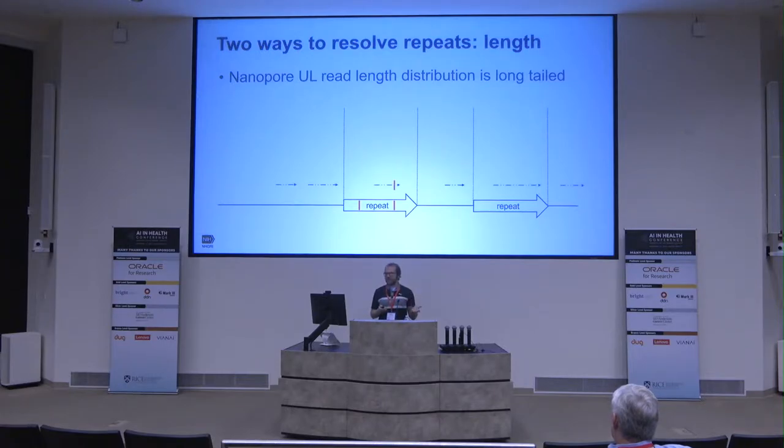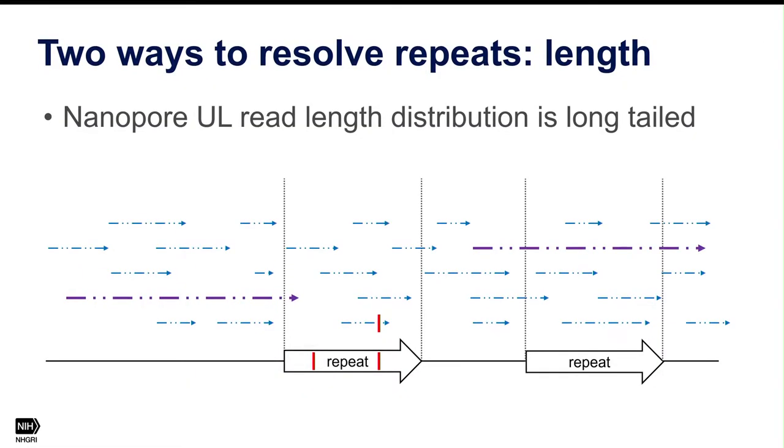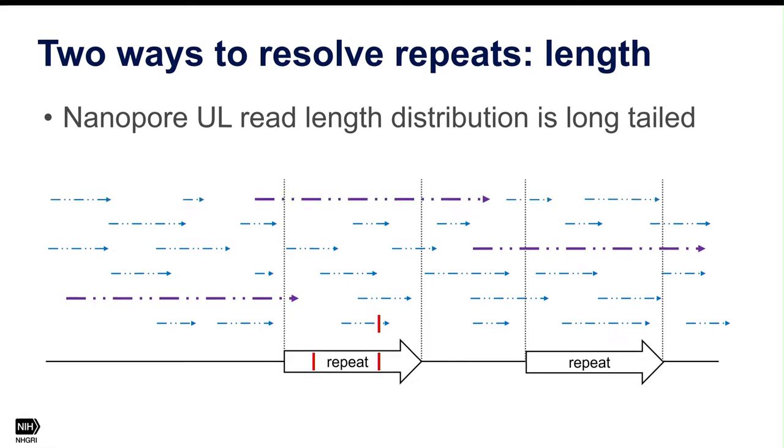And so when we start sequencing, these are drawn as reads. They have the little dots indicate errors in the read, so they're not perfect. They have some errors when we read them. So if we read all these reads, we can reconstruct this genome correctly, even though we never actually see the specific read with a variant, right? Because the reads are too noisy for us to show that single difference between the two repeat copies.